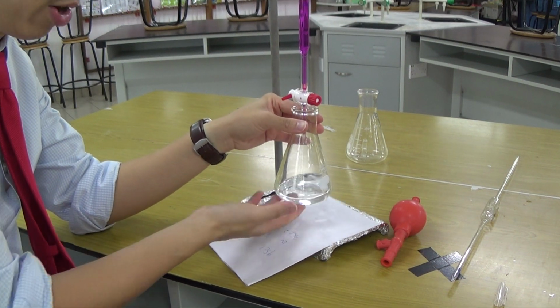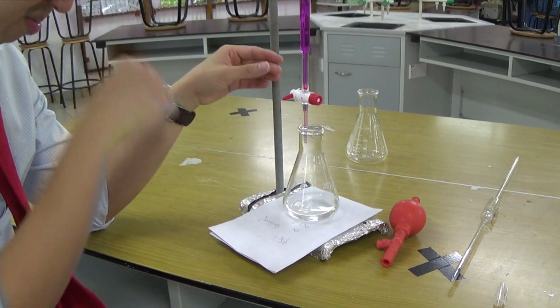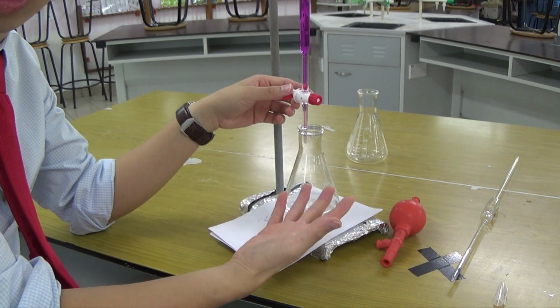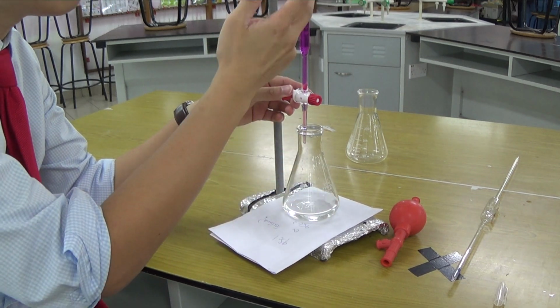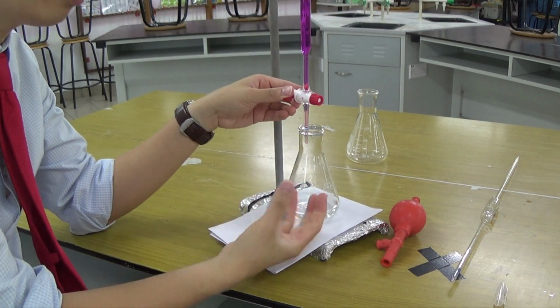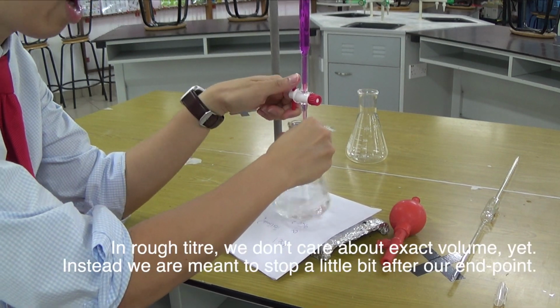But because this is a very diluted solution, it doesn't look that colored at all. But when there is no more iron 2+, when everything has been converted to iron 3+, then an extra drop of these is going to make the MnO4-, the one responsible for the purple color, remain in there unreacted, and therefore you will get a permanent pale pink or purple, depending on how much you have.